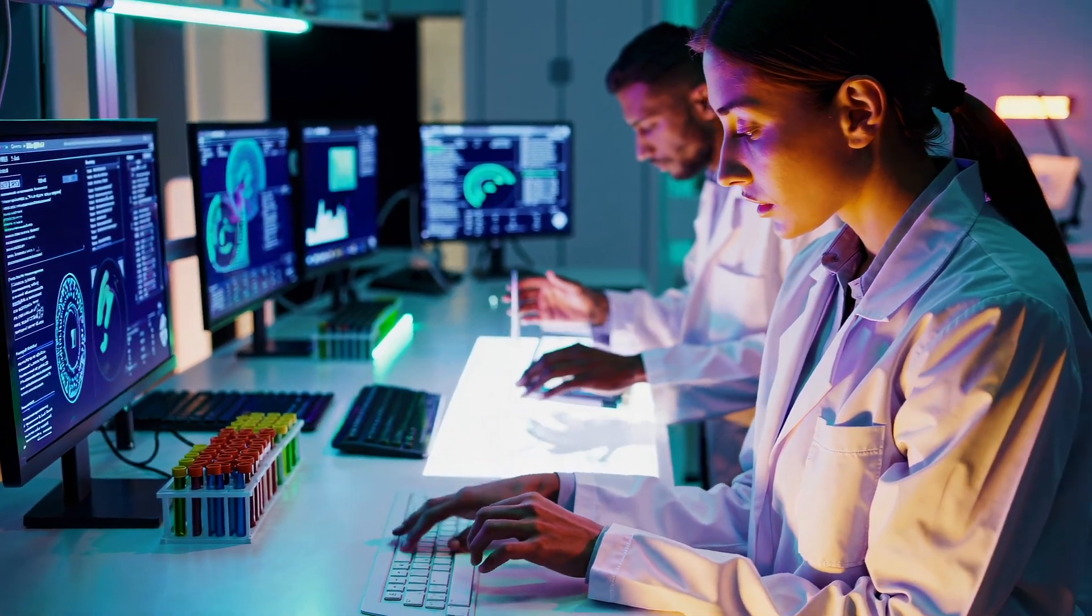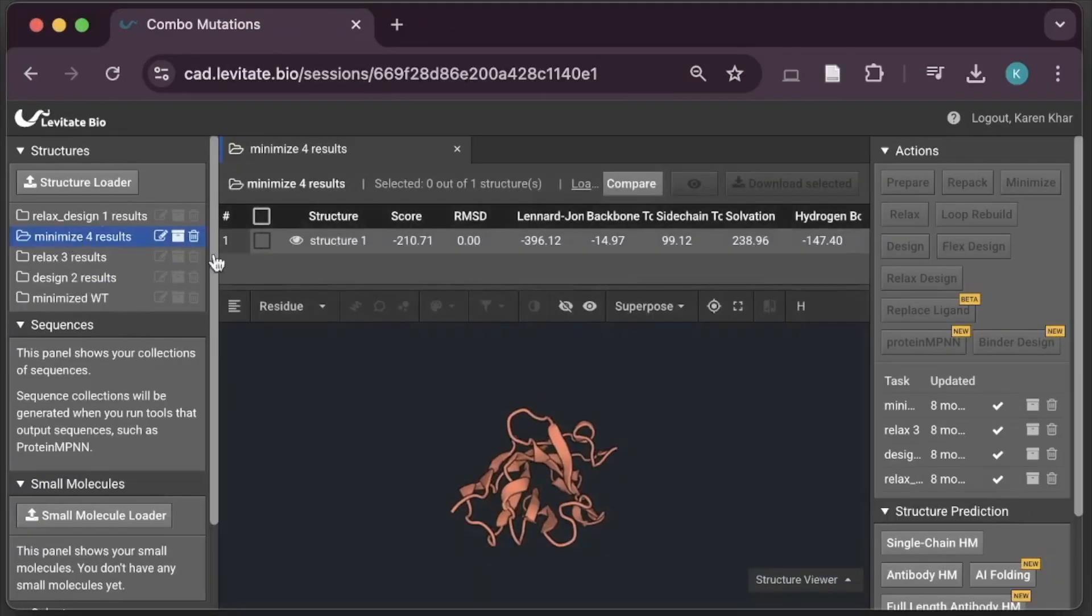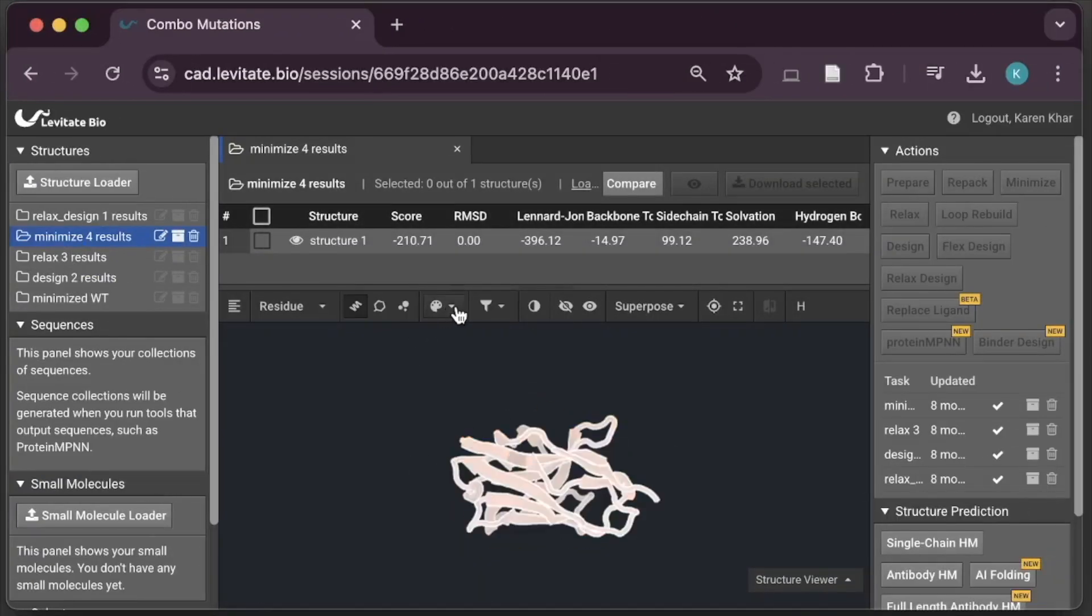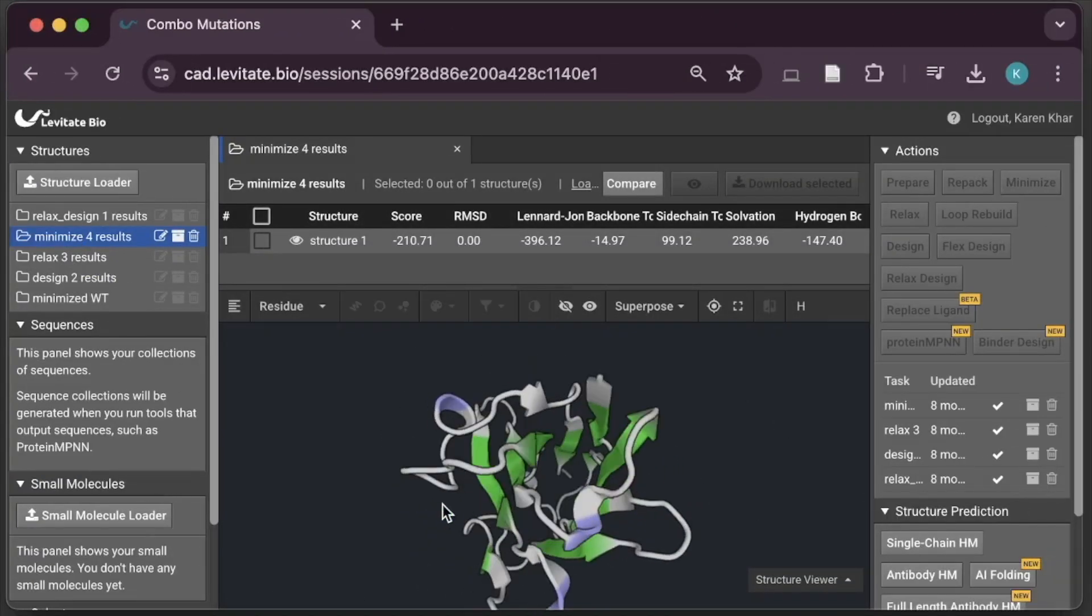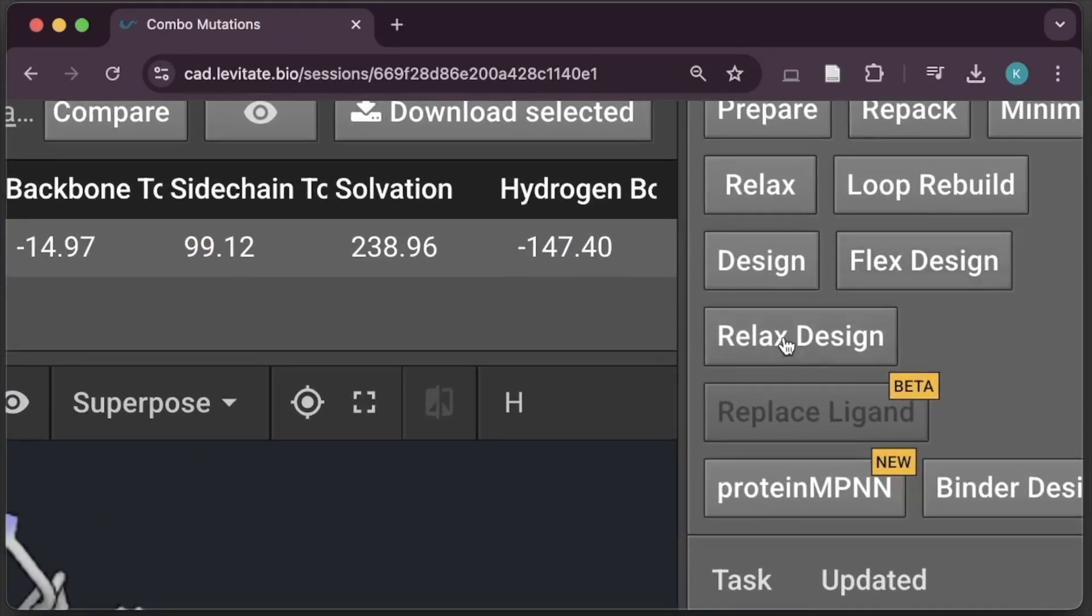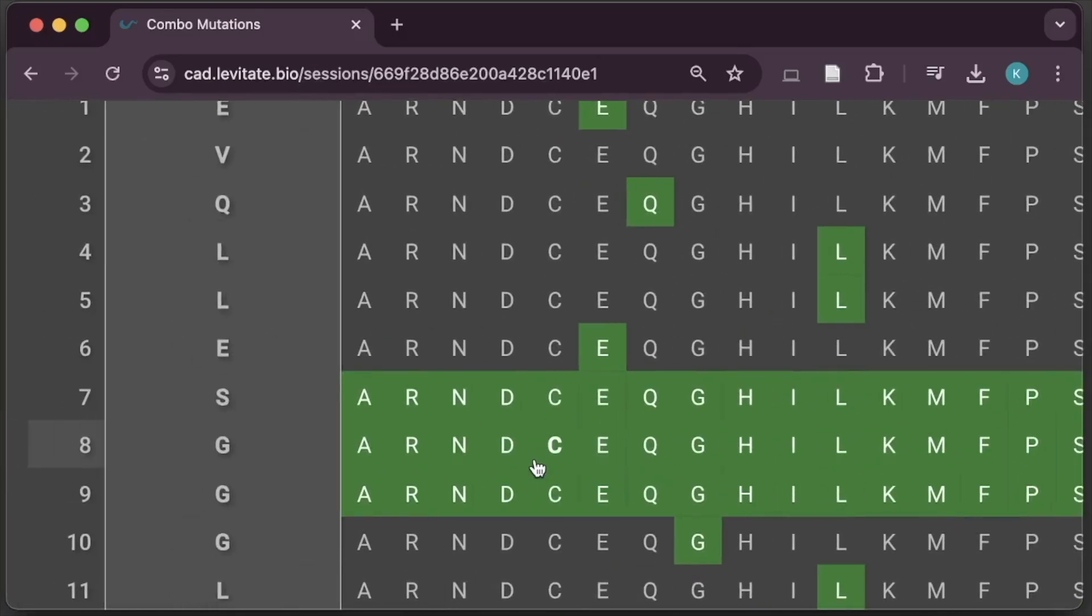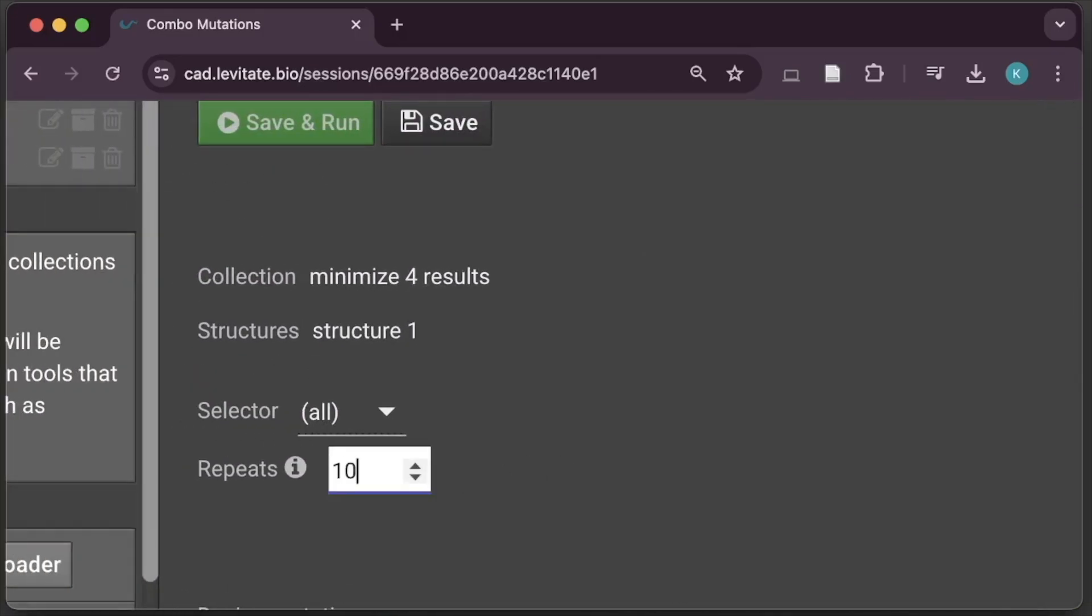Imagine designing a brand new protein binder in just a few clicks. Levitatebench makes protein modeling and design easy with a push-button interface that runs entirely in your browser.